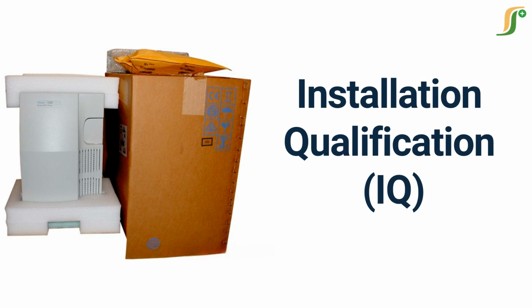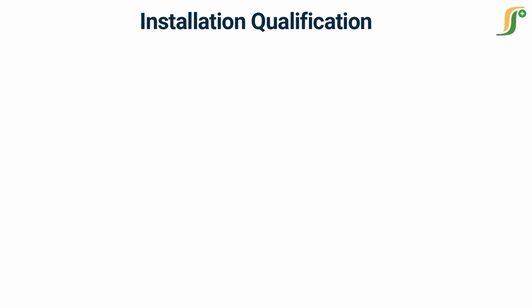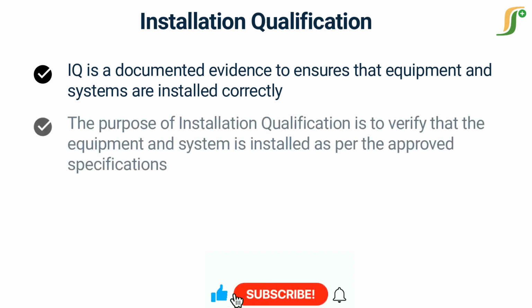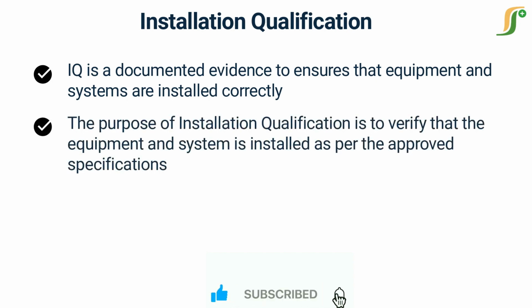Today we shall discuss installation qualification. Installation qualification is a process that is part of the validation process in the pharmaceutical, biopharmaceutical, and medical device industries. It is a documented evidence-based process that ensures that equipment and systems are installed correctly and meet predetermined specifications. The purpose of installation qualification is to verify that the installation of a piece of equipment and system has been carried out in accordance with approved design and installation specifications.